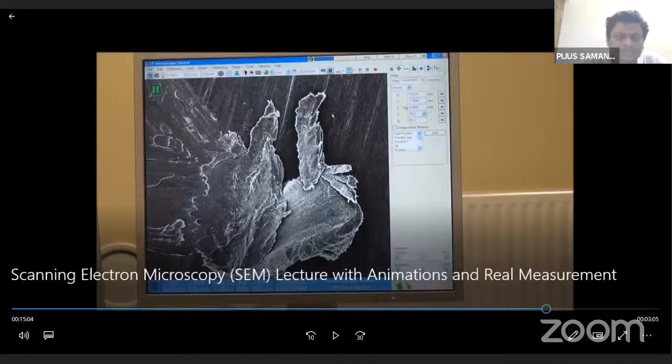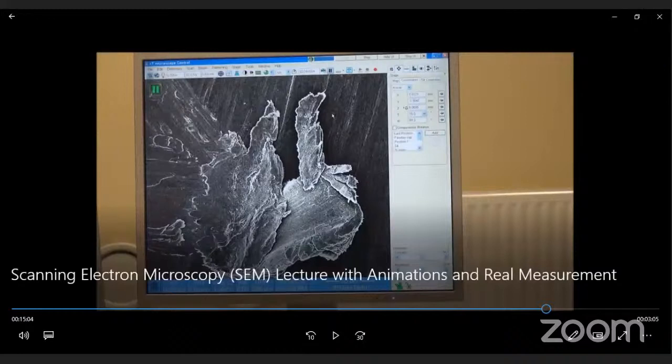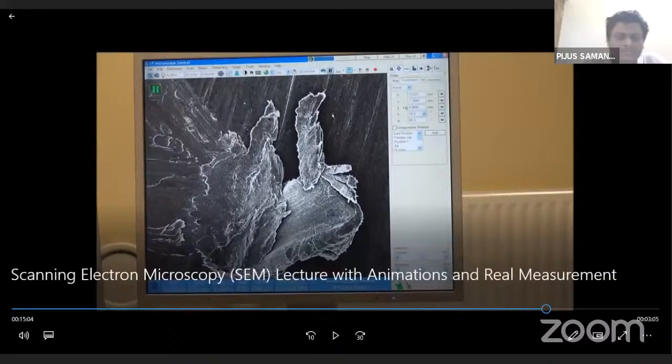The beauty of the transmission electron microscope is that its resolution is very high compared to AFM. And obviously, as it is transmitted, we can have finer detail of the structure, like stacking faults, several kinds of defects, other critical layered formations, etc. That will be clearly observed from the TEM also.